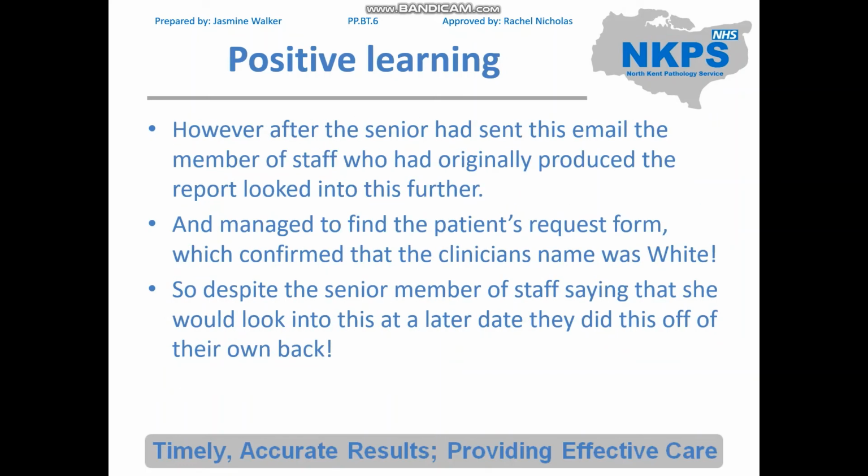This has then saved time because it meant that we got to go back to this member of staff very quickly, and it showed that if there is an error, then it's probably in how the LIMS was set up. So it was very, very useful, and it helped out in the long run a lot more, because let's be honest, the senior would have probably come in the next day and just completely forgotten that they'd said they would deal with it, because there's always 100 other things on our minds, right?